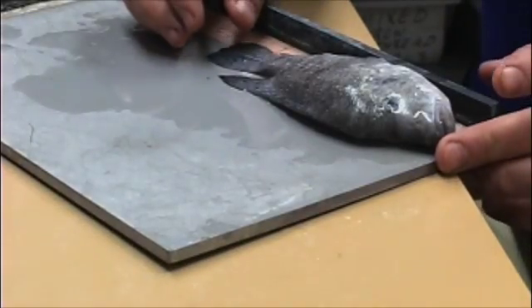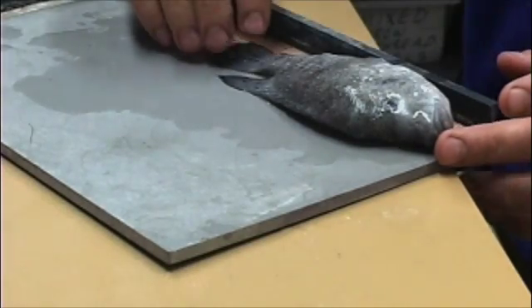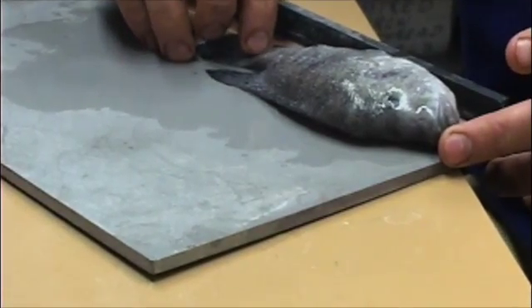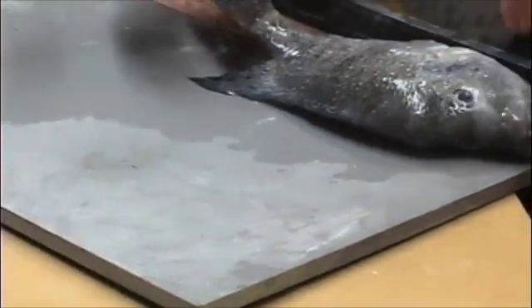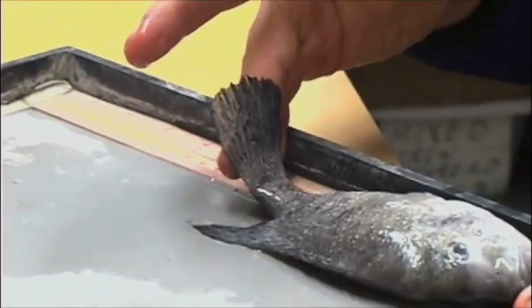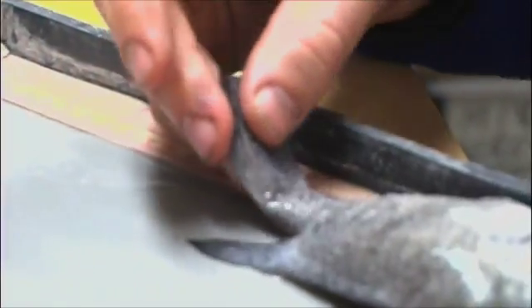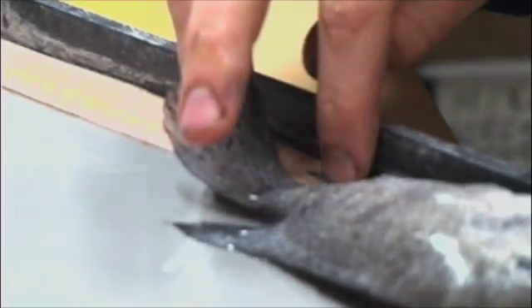The second measurement I'm going to take is called the standard length. That's the length from the tip of the snout to the end of the hypural plate, which is basically the end of the skeleton. There's a bony plate here, and the way to see where that is: when you fold the tail, you create a little crease, and that's basically the end of that hypural plate. In this one it's 135 millimeters.